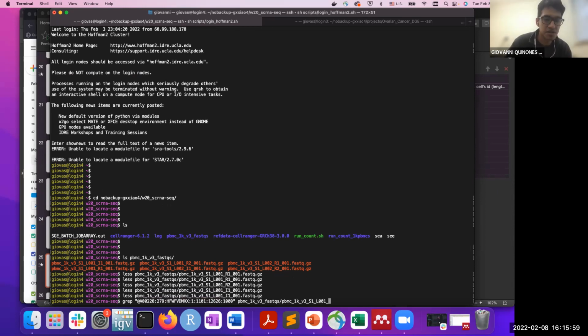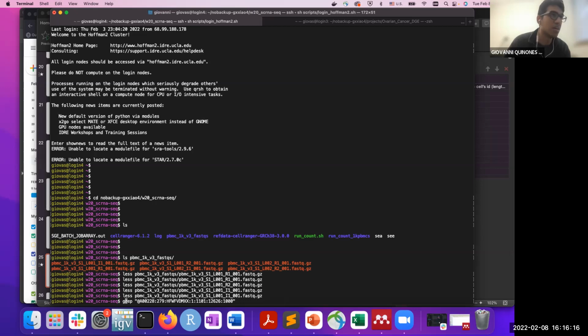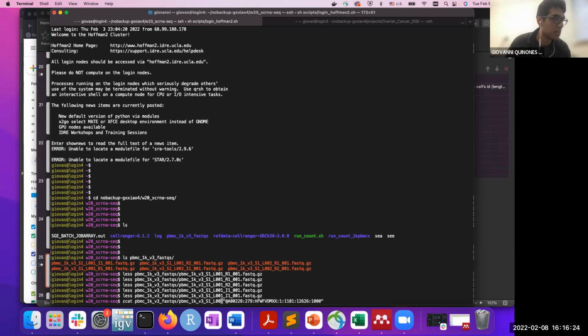People have questions. Jenny? Sorry, I just had my hand raised from before. Oh, okay. Yeah. And Shabnil? You have a question?